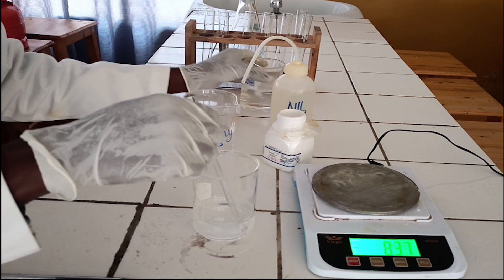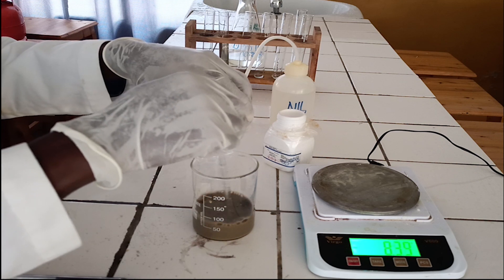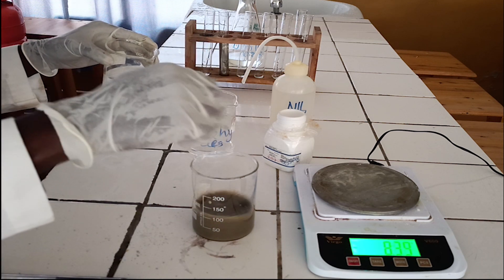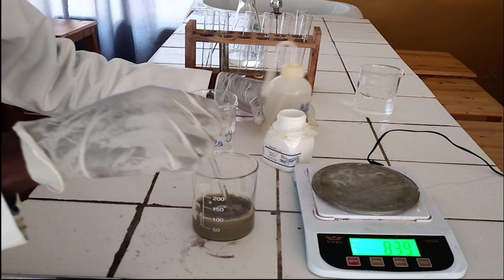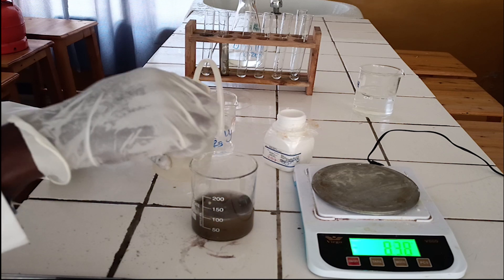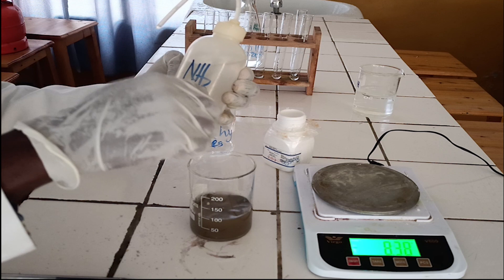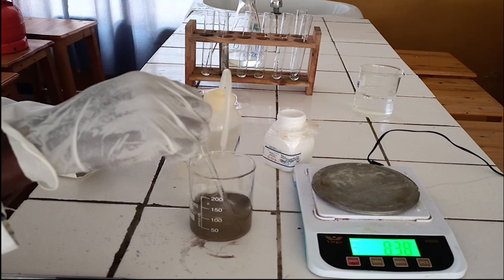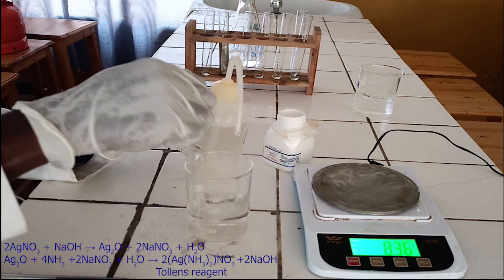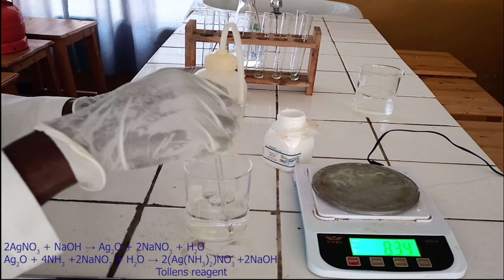To the solution of silver nitrate, add sodium hydroxide dropwise. Silver nitrate reacts with sodium hydroxide to produce a precipitate of silver oxide. On addition of ammonia solution, the precipitate of silver oxide dissolves to form a colorless solution. This colorless solution contains the diamine silver(I) ion; hence the solution is called Tollens Reagent. Below there is an ionic equation for these reactions.